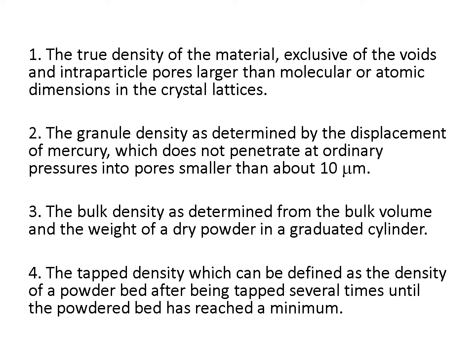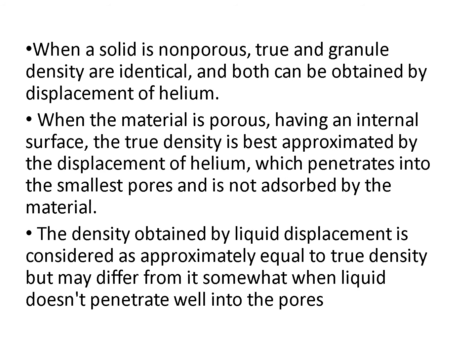Okay, so our objective today is to measure the true density and how we can measure that true density using a helium pycnometer. A helium pycnometer is a device using helium, in which the helium can displace the inter and intravoidage.